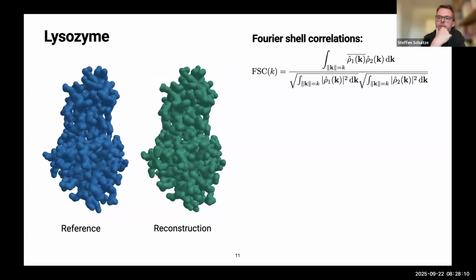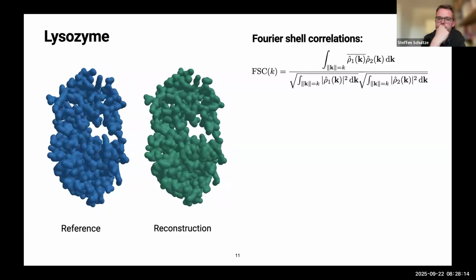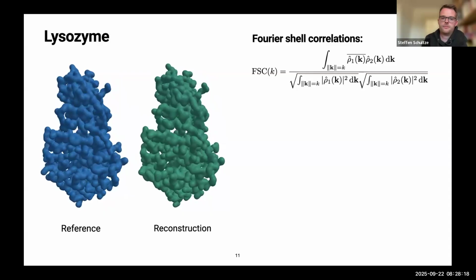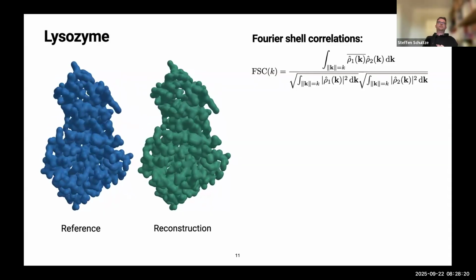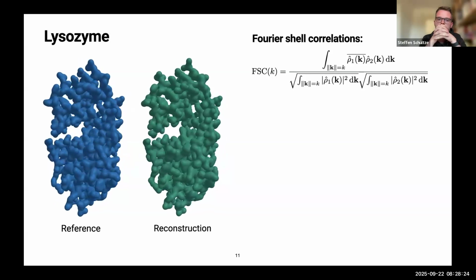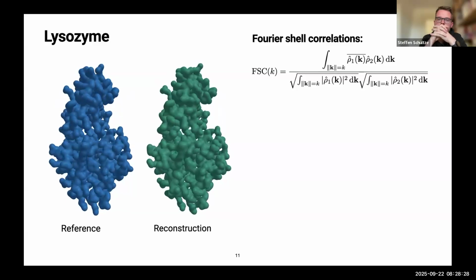Yeah, so I'm not familiar with X-ray at all. So I was wondering, can you just give a quick description of what the experiment looks like? Do you have to purify and put it in something? And also related is, why do you have access to so few photons? Why can't you just throw more photons at the sample?